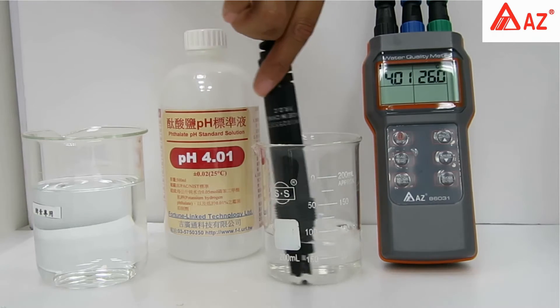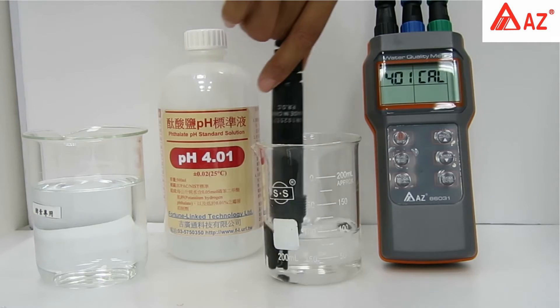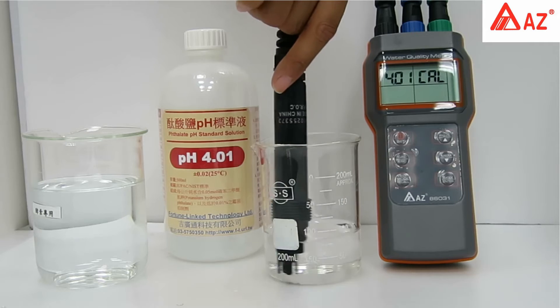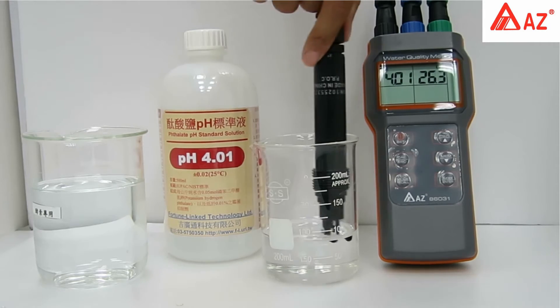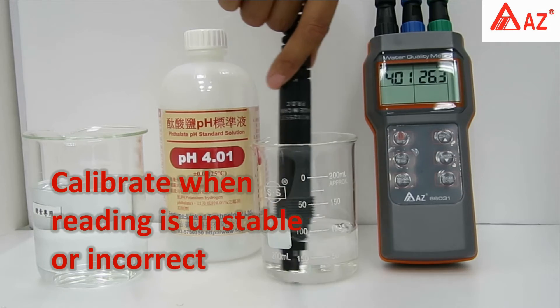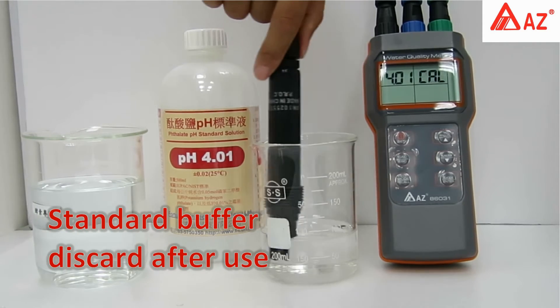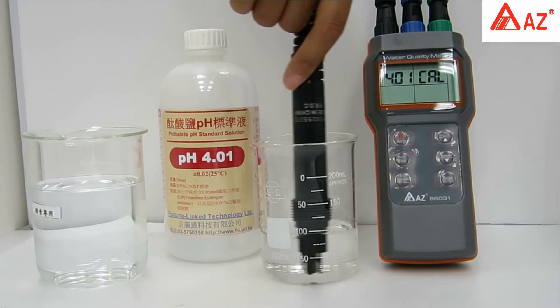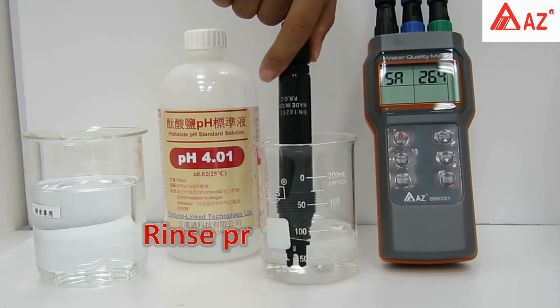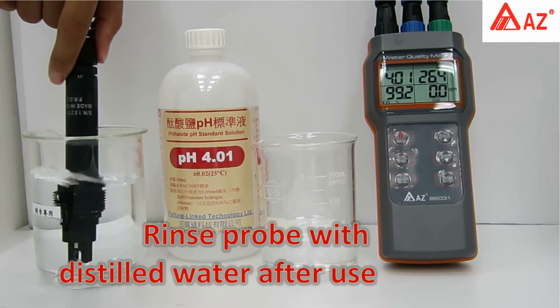If the auto-recognized value is different from the standard, adjust using the up and down keys. Use a transparent container and make sure the pH electrode is completely immersed in buffer. Stir gently for a homogeneous condition. Perform calibration when the pH reading is unstable or incorrect. Standard buffer should be discarded after one-time use. Wait 30 seconds or press Enter — SA indicates the result is saved. After use, rinse the probe with distilled water.